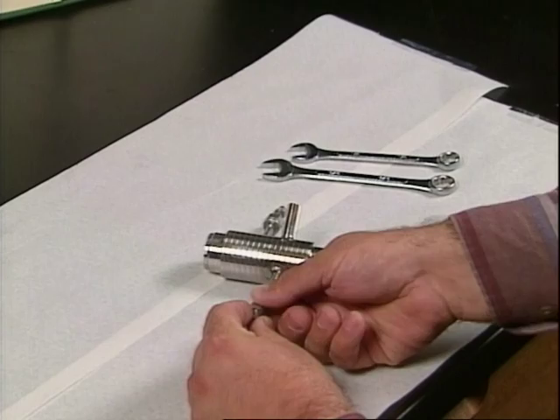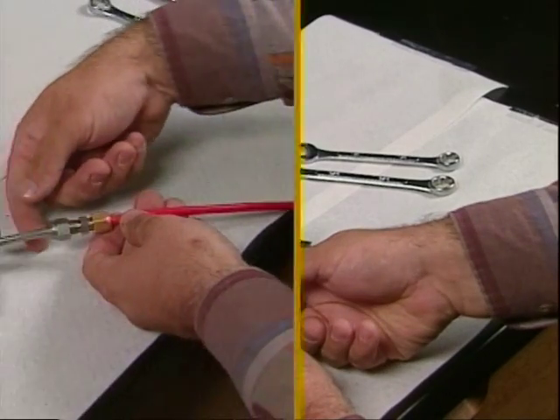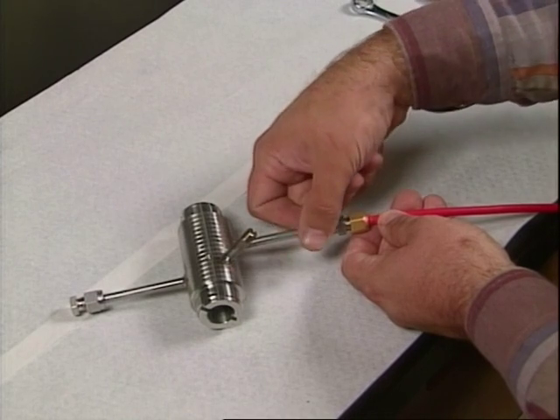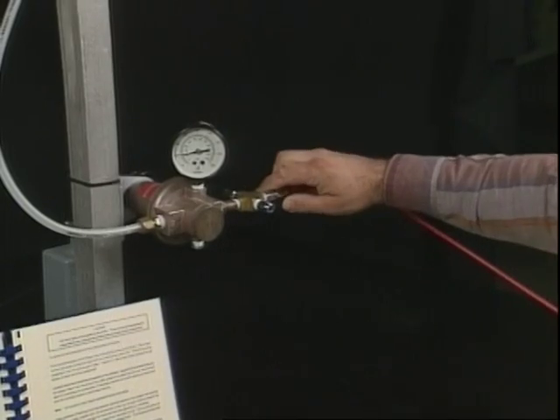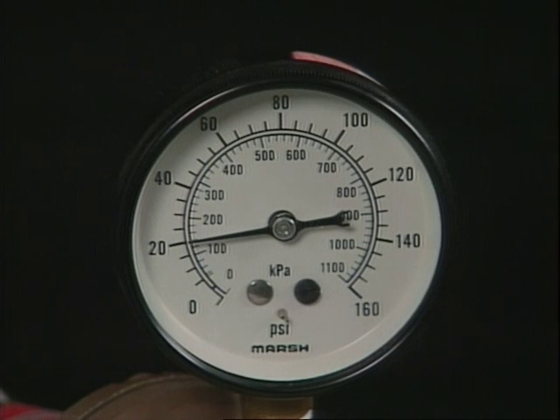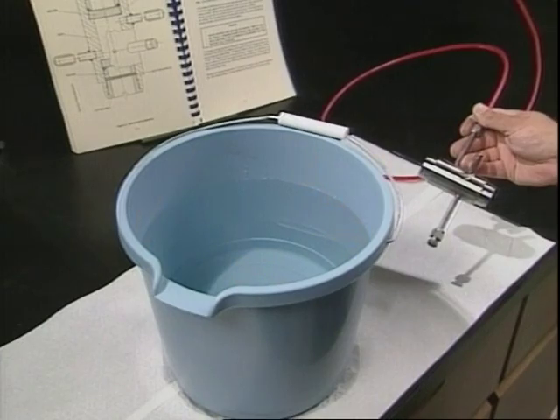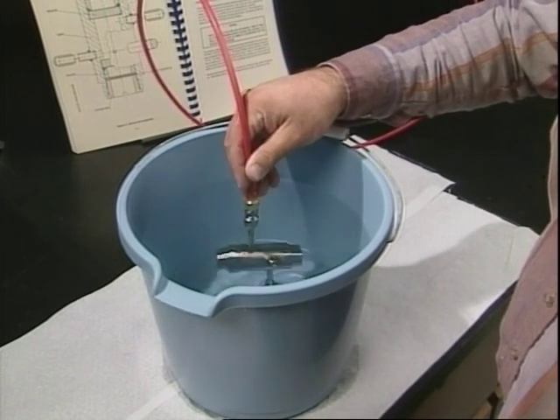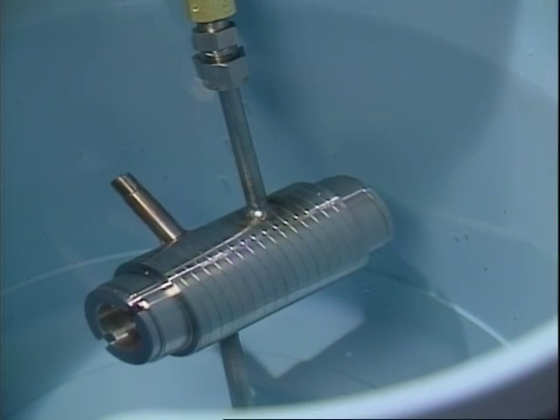First, cap off the sample cell inlet. Connect an air pressure source to the cell outlet. The connection should be sealed tightly. Apply moderate air pressure. Be sure not to exceed the pressure tolerance of the cell. Then, submerge the sample cell into a container of water or spray the cell with leak detector.